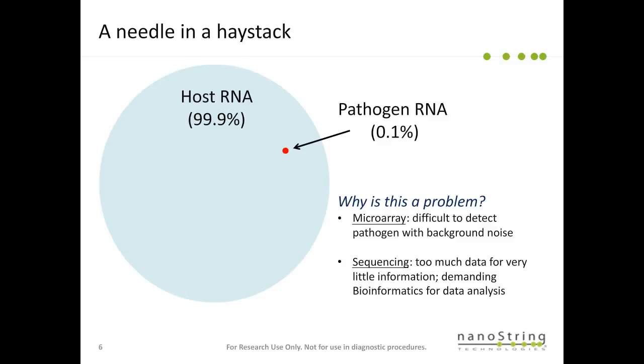And why this is a problem is because in many of the existing gene expression profiling platforms, such as microarray or RNA-seq, it's very difficult to handle samples like this. It's a mixed sample with only a tiny portion of the RNA being what you are interested in. This could cause a lot of background noise for microarray, and for RNA-seq, basically you waste a lot of your reads on the host RNA, and it is also pretty demanding for the data analysis.